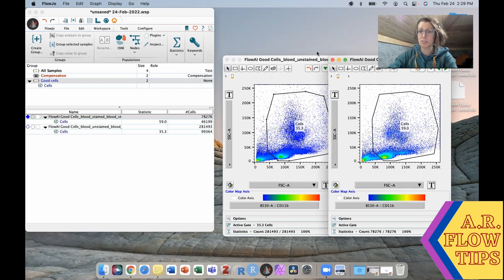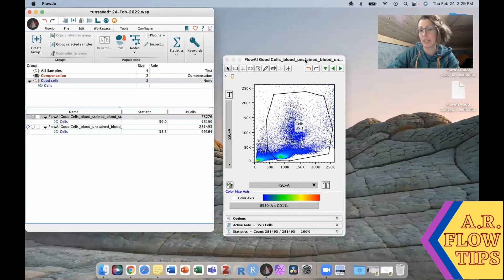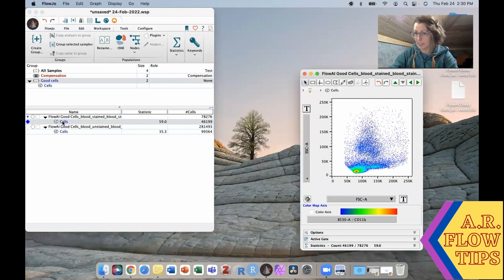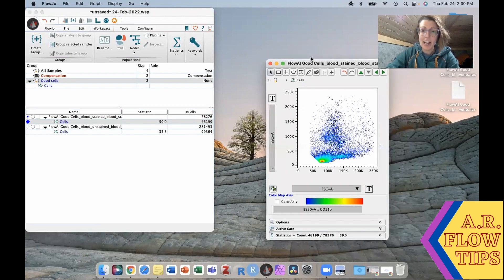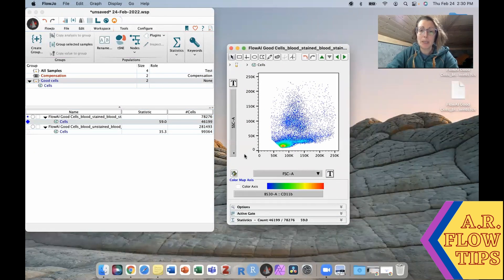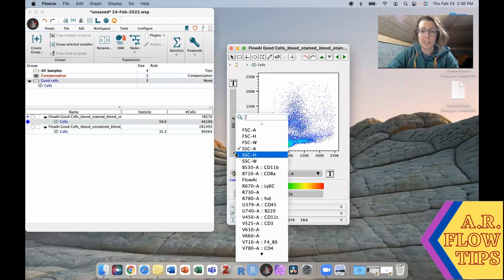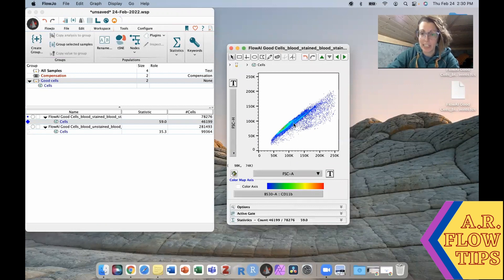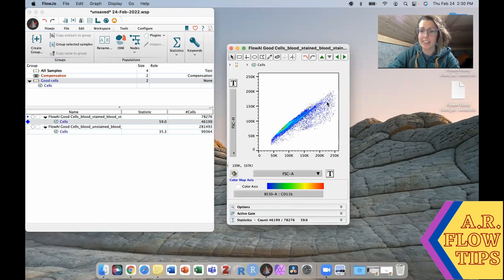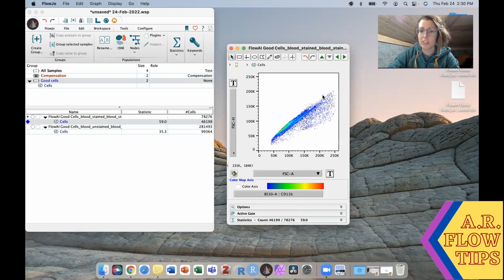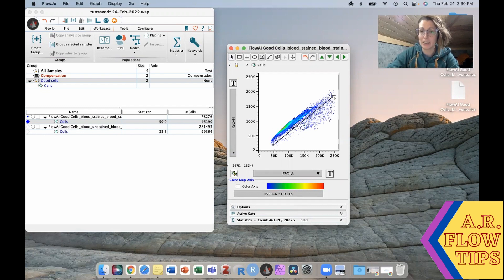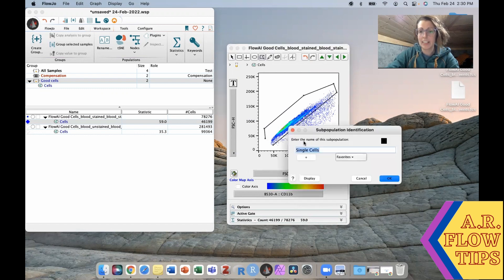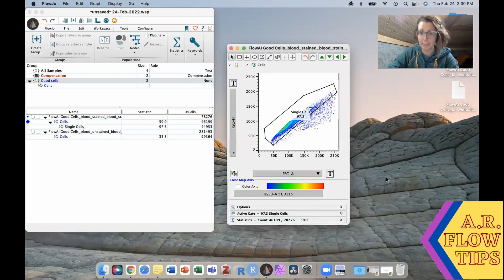To do that we're going to open up the cells we are going to work with and generally people will do forward scatter area versus forward scatter height. So you can see on here we have our nice population of single cells and then this cloud down here are our doublets. So we can get a gate that nicely bisects those two populations, bring it up and around and close it off.